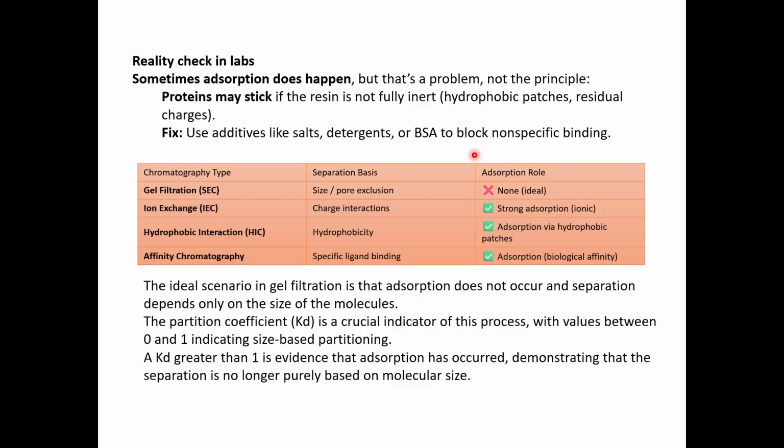Like you block in the case of your Western blot or any other antibody related studies or experiments like immunofluorescence, IHC, etc. So you actually have something called blocking, where you use either BSA or skimmed milk in the case of Western blot to block the other background areas of your membrane or of your tissue where your antibody might bind accidentally. So to avoid that background noise, we will block it.